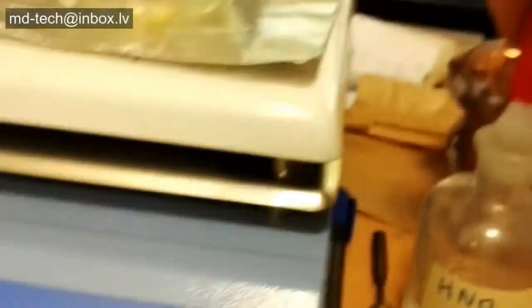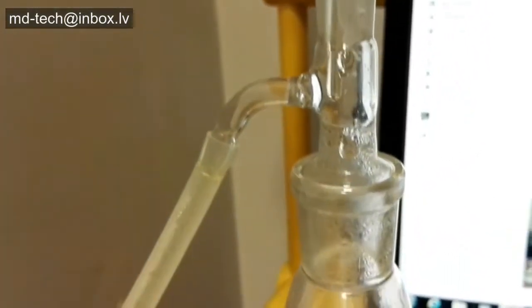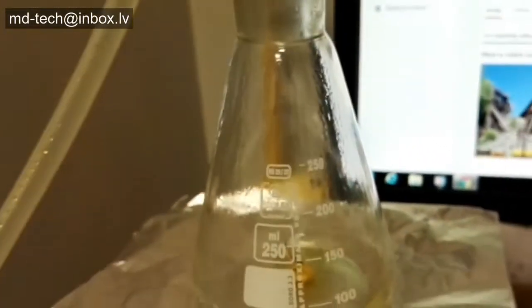Aqua regia, which is three-part hydrochloric acid and one-part nitric acid, has the ability to dissolve gold, platinum, palladium, and other base and precious metals, and put them into a solution of aqua regia.